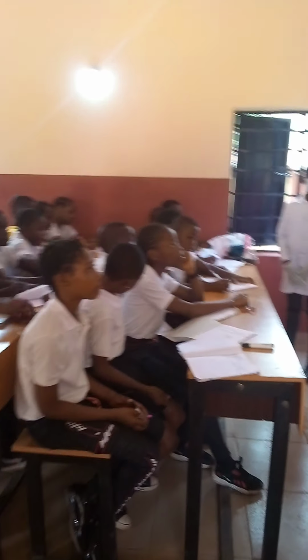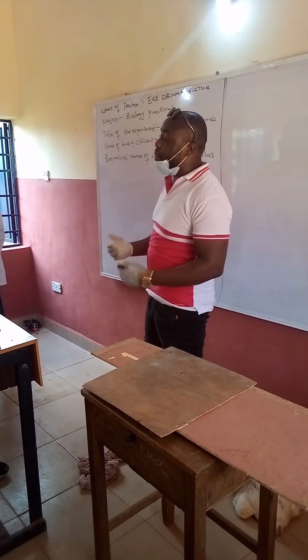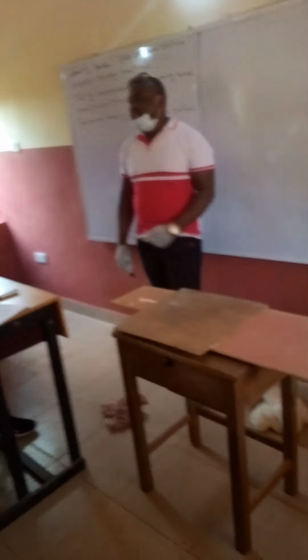Now listen, anytime you carry out a biology practical using a particular specimen, whether plant or animal, you are required to provide the botanical name of the specimen you are using. Now this specimen is a chicken.